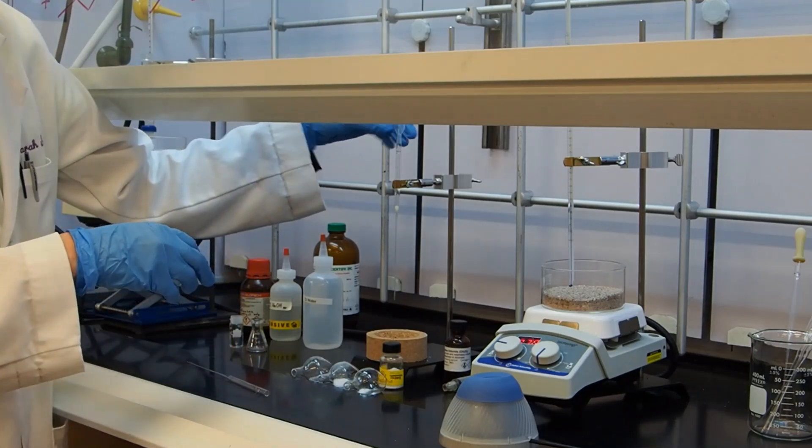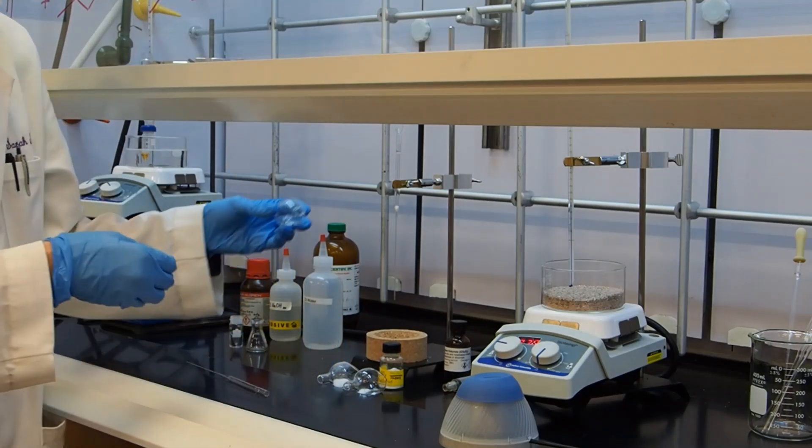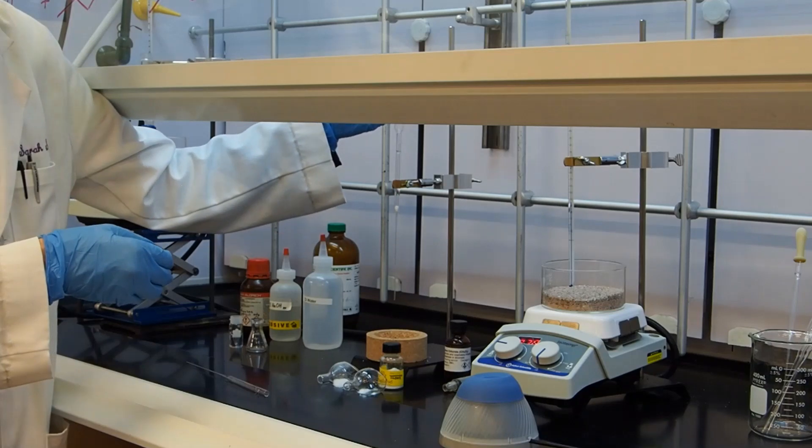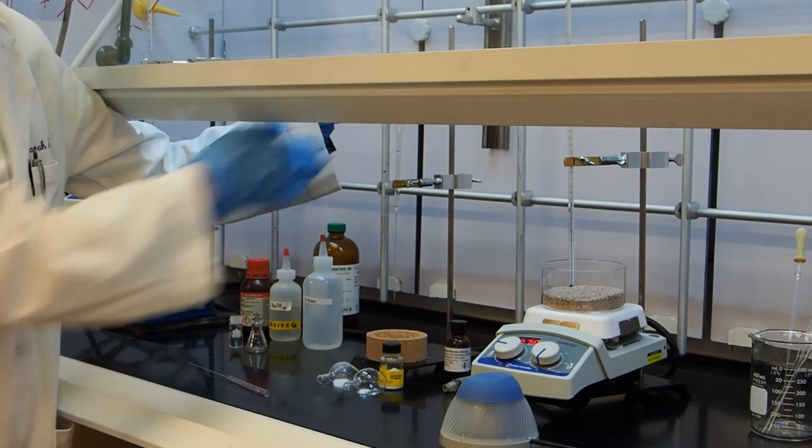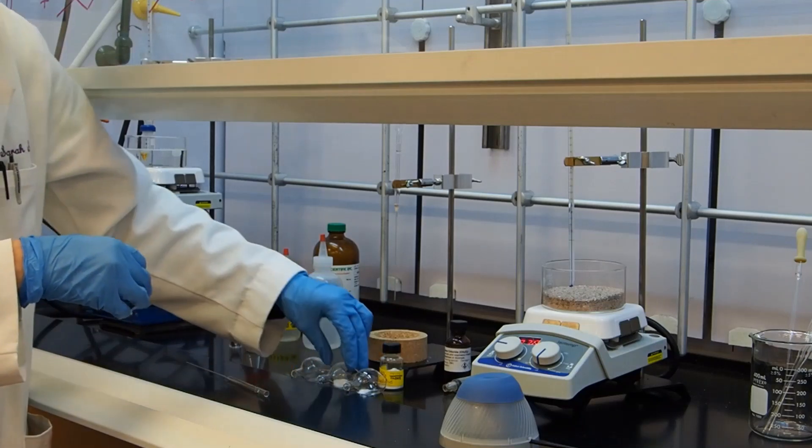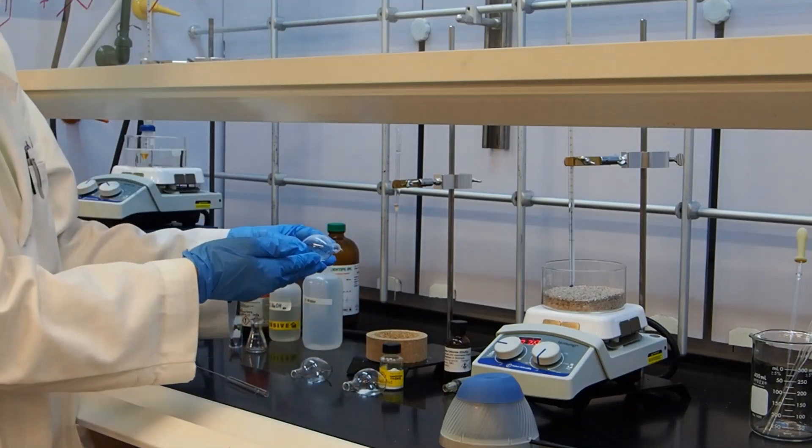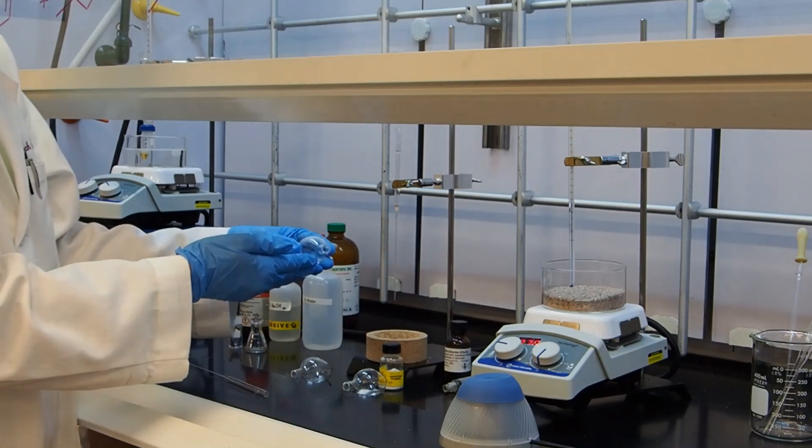I can put my funnel back on. I have to go in first about 50 milligrams of sand. That's going to keep the cotton from getting plugged up with silica gel. Next we have some fine silica gel, about 500 milligrams or half a gram.